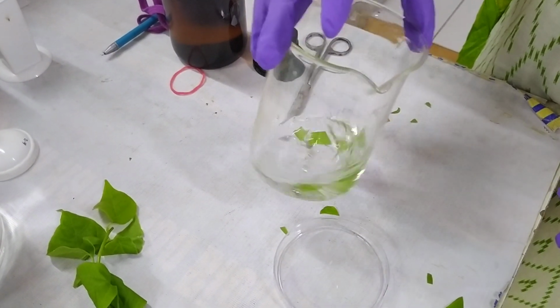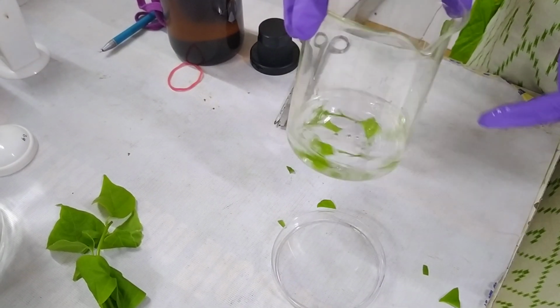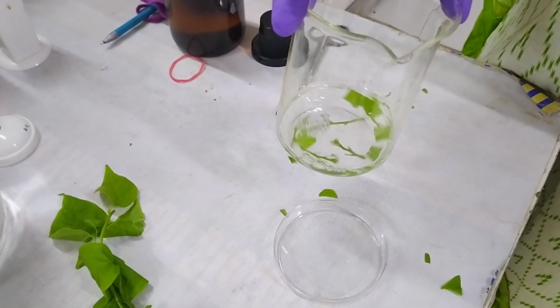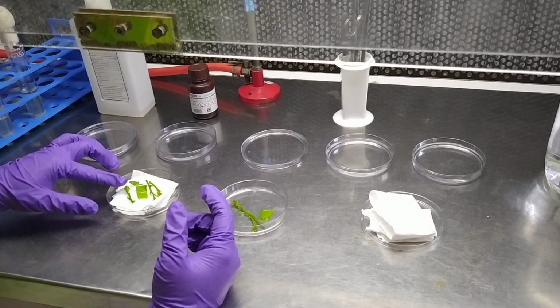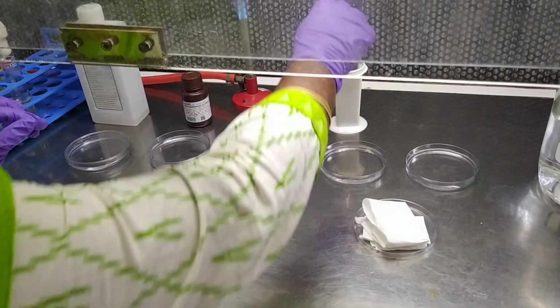After a few seconds, we are going to drain off the Tween, wash it with water, and then take it to the laminar. Continuing with the sterilization, we have washed it with Tween and rinsed it with water. Now going in for the surface sterilization steps.